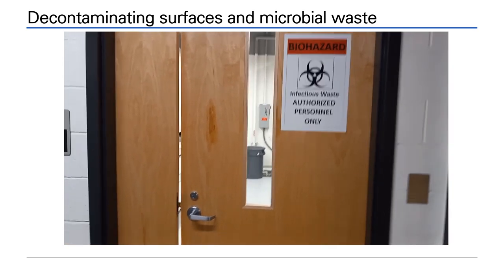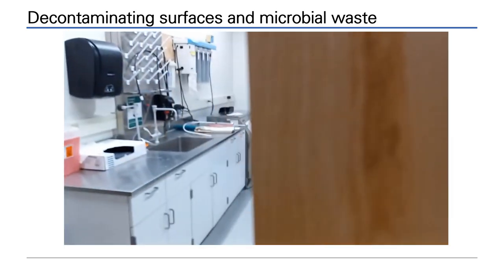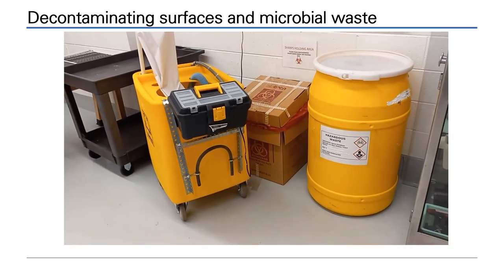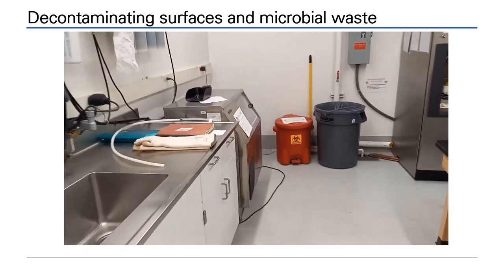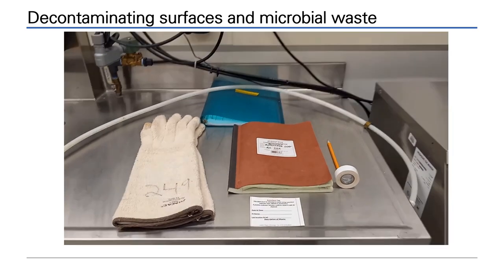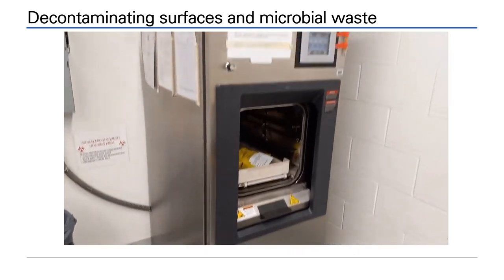All waste generated from the laboratory enters the autoclave room for sterilization. Within the autoclave room, you will see the industrial autoclave and holding stations for biological and chemical waste. Microbiological waste must be logged and labelled. Autoclave gloves are used to handle the hot, sterilized waste.